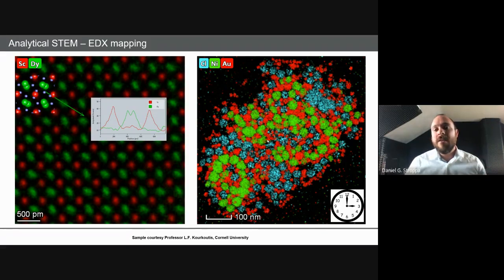Then, for instance, if we have one of STEM or TEM, we don't need something like XRF to characterize the chemical composition, right? Is it correct? Not exactly. The techniques have complementary aspects.